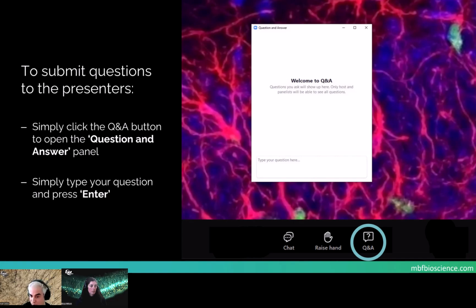But you can also bring, for example, images from a Stereo Investigator system, if you are collecting your images following SRS and you have your XML file. You can just provide those stacks with the XML file, and that would also be useful for us. So any kind of image modality or image type is fine, either the whole region of interest or just a subsample of those.